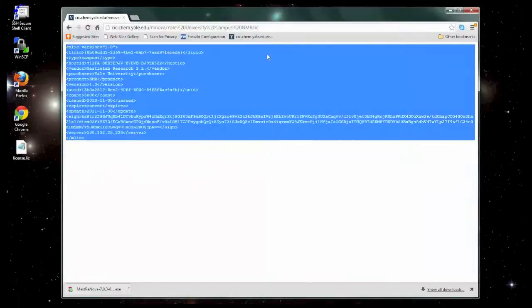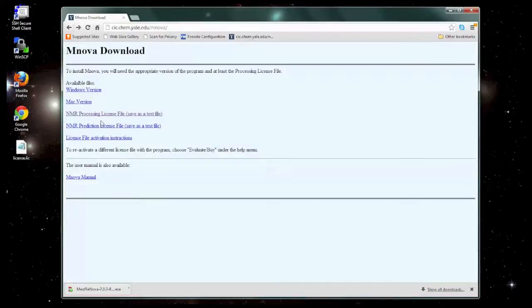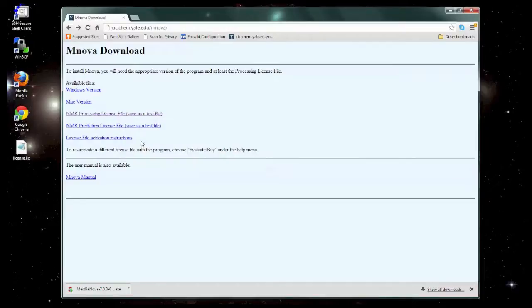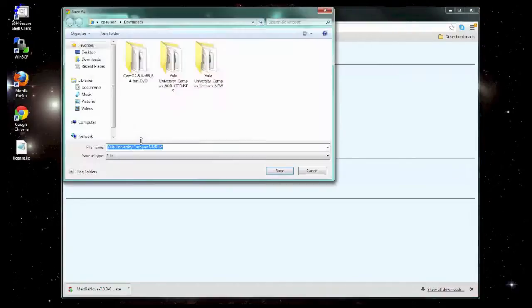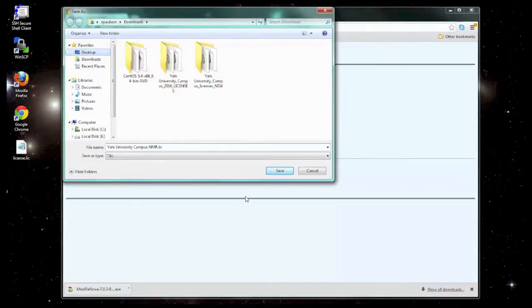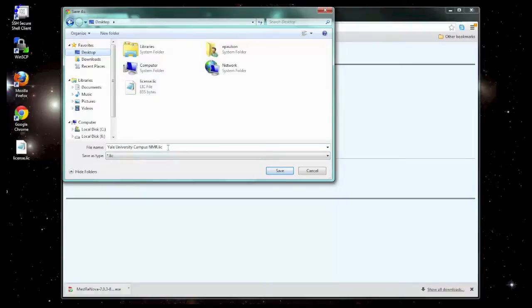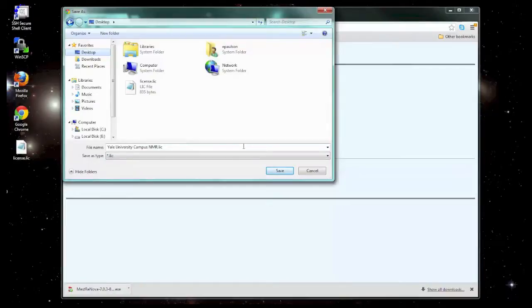Now another option, a different way to save the file, is to right-click and select Save Link As, and go ahead and save the file on your computer this way. However, beware that some computers seem to try to recognize this file as an XML or an HTML file and rename it or change it, which causes problems. So if this method doesn't work, try the other method.